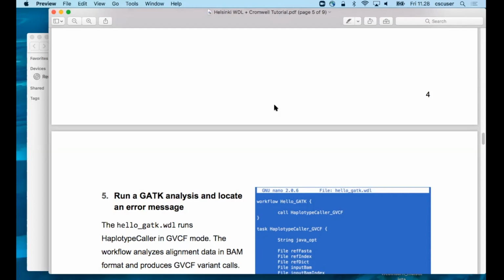Is that no longer supported? Oh, deprecated, WDL draft 2. Is it WDL draft? Is the turbo one WDL draft, or is it WDL 1.0? It is draft 2, so it should work. I mean, unless somebody's updated it. Oh, I think I need to highlight mode.